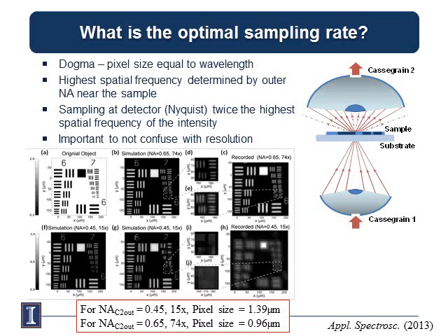It turns out the considerations of spectral localization for chemical imaging, where there are spectra associated, compared to optical imaging or microscopy are actually different. The resolution criteria are different. The information you can extract from a certain pixel size is different, and you can read all about it in this paper. But what we were down to here was micron scale imaging. So if you're interested in wide field imaging in the far field in IR microscopy, you should be using pixel sizes that are about 1/10 of the wavelength roughly, and you'll still get enough information out of that data, but you can read about it here.